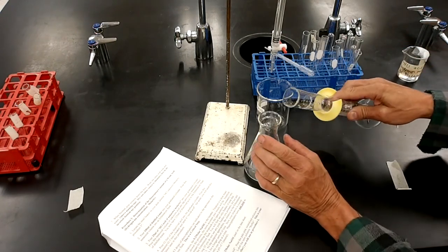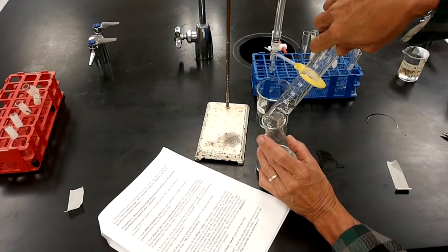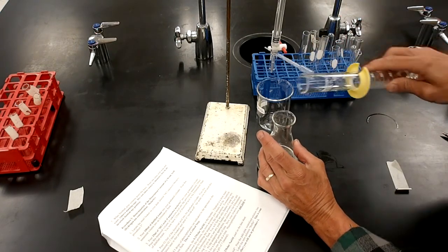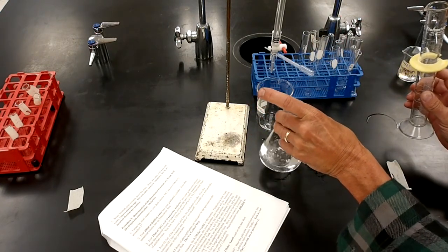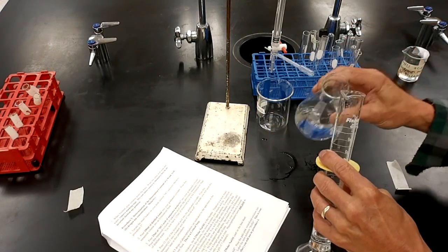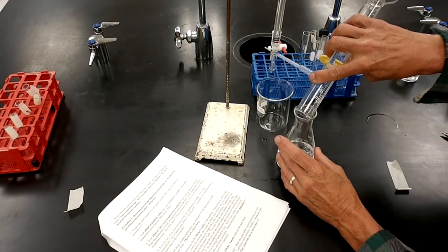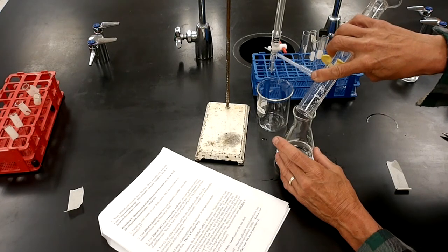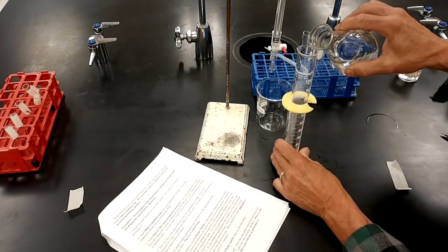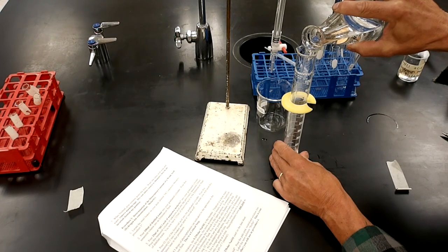25 milliliters of the unknown acid. Add it to 100 milliliters of distilled water. Give it a moment to mix. All right, then I'm going to cut this solution in half. We're going to use half of it for another procedure. So half of 125 should be 62.5 ml.